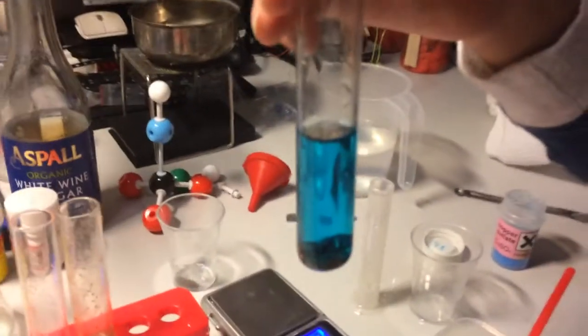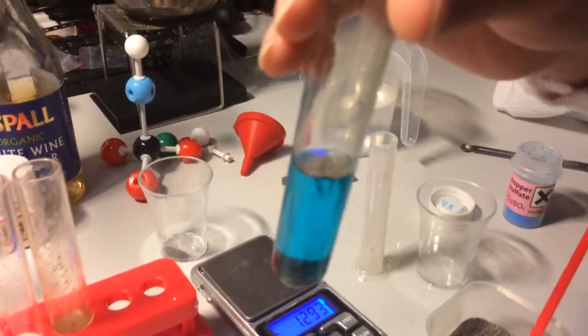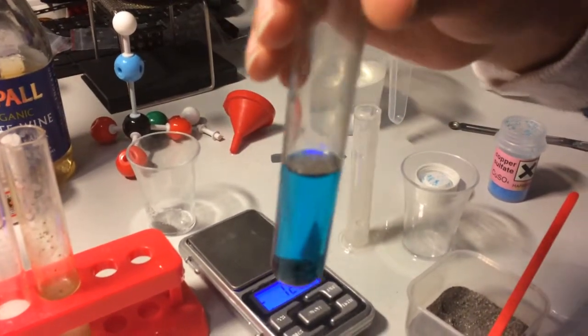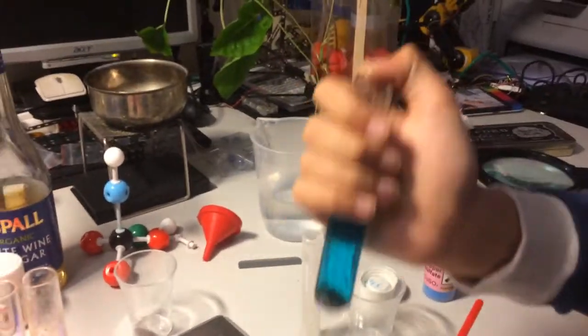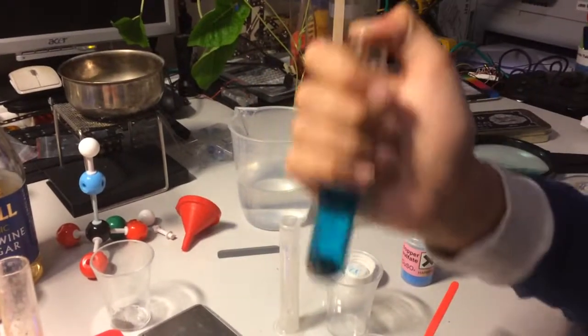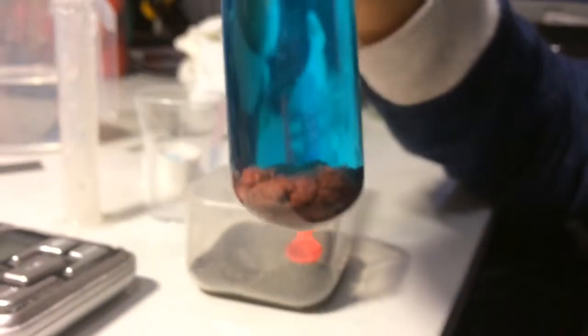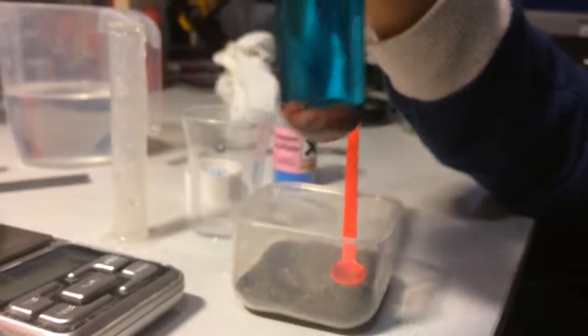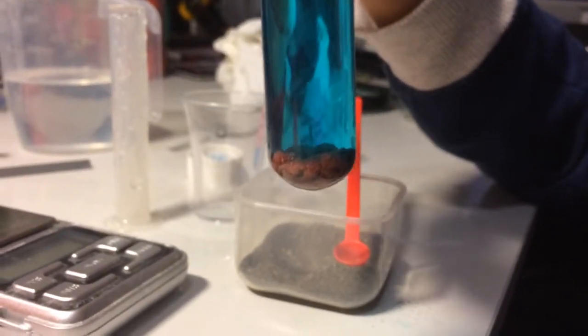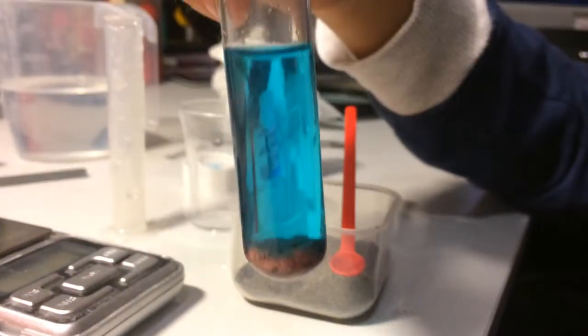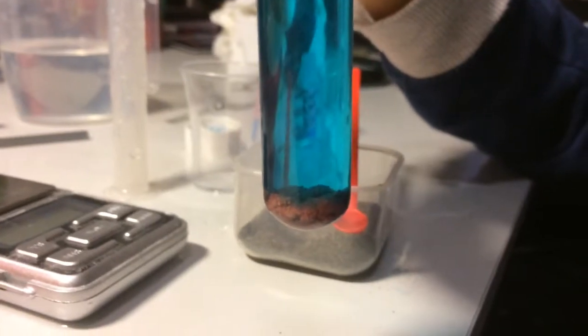As you can see, it's already sunk to the bottom with only a bit of it floating at the top. Now, after a little mixing, the iron filings have turned reddish brown. In fact, they are not even iron anymore. Now it's copper. Let's do a bit more mixing and see what happens.